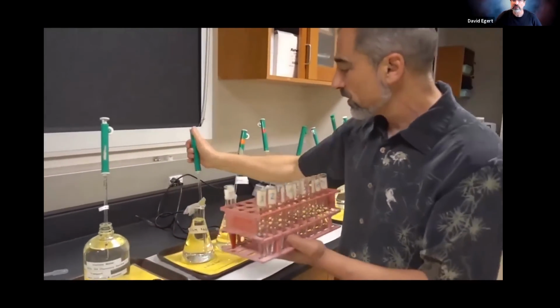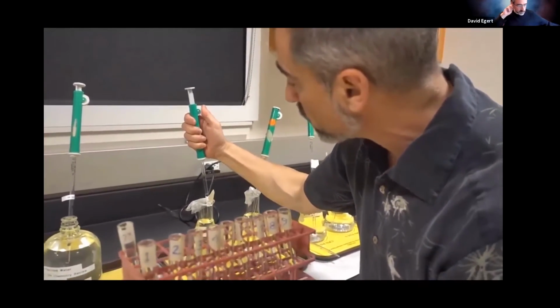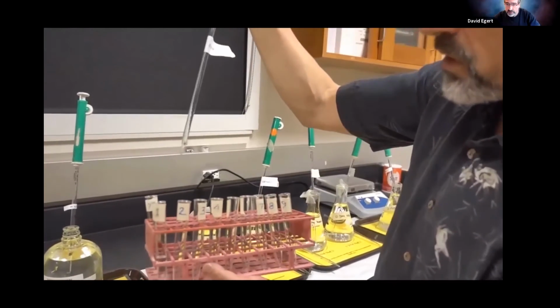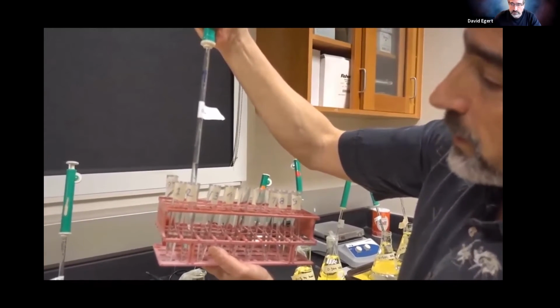I'm going to get 3 mils of my 0.05 molar NaCl. Again, just suck up to the 0 and put that in the appropriate test tube. Dispense 1, 2, 3 mils.